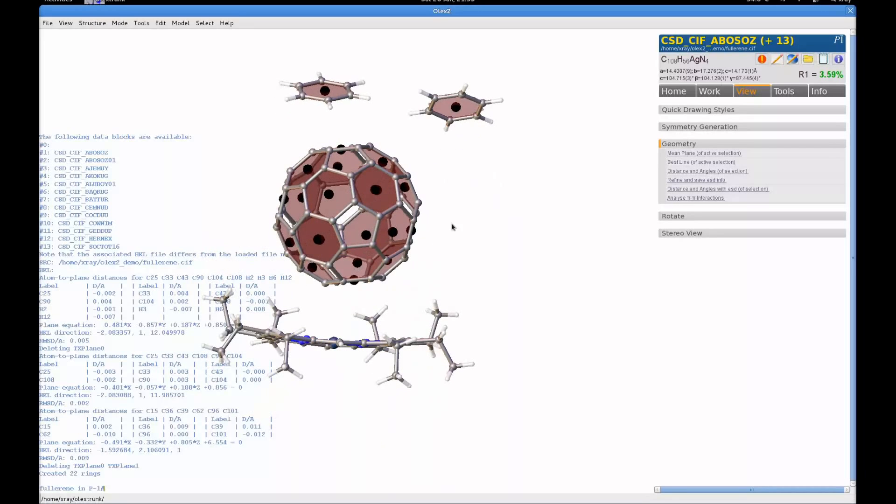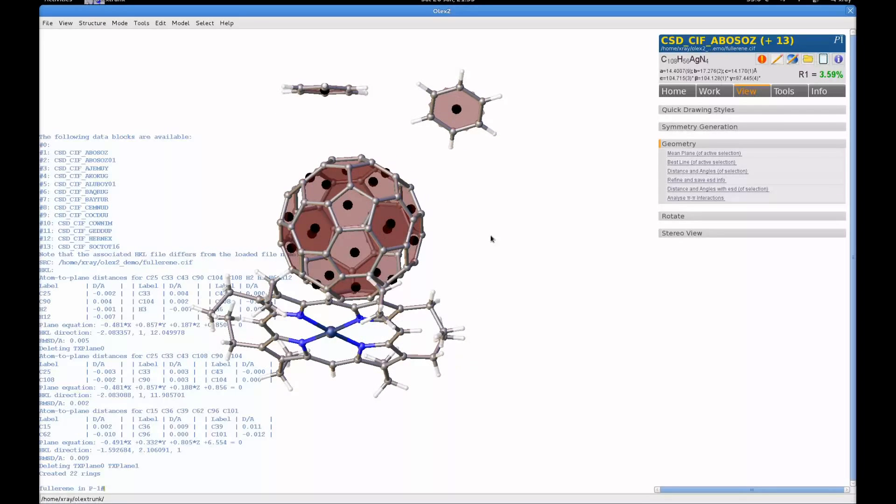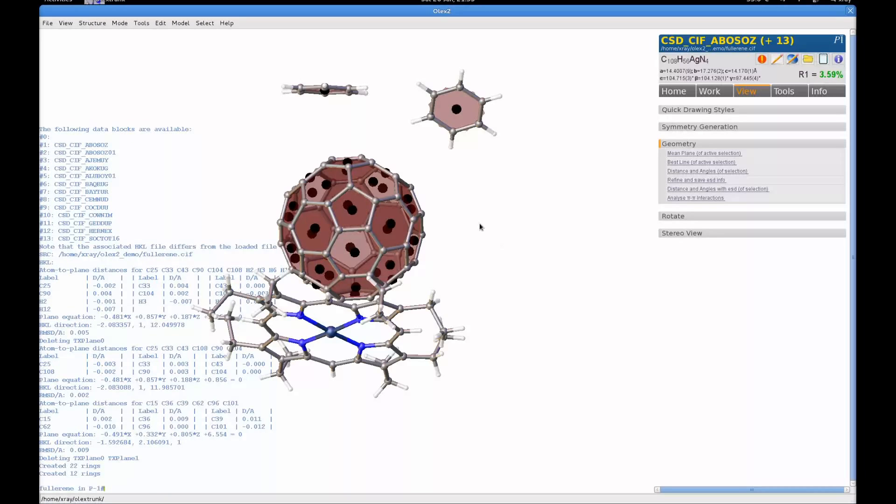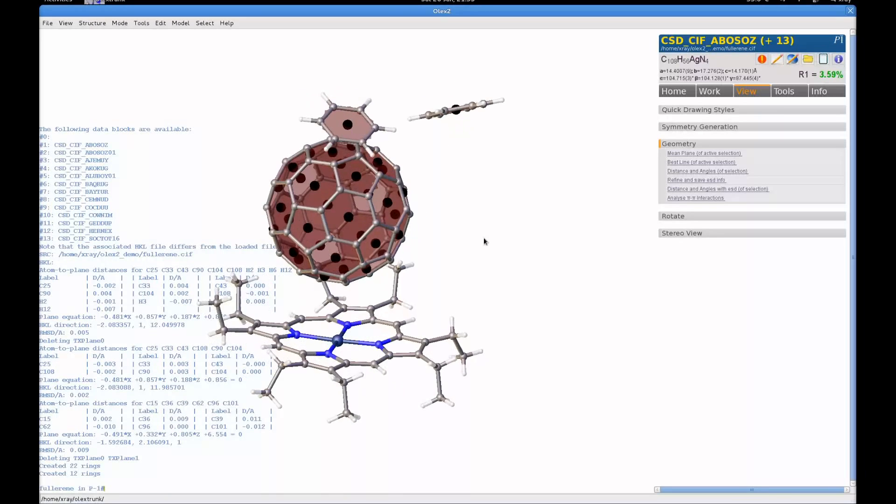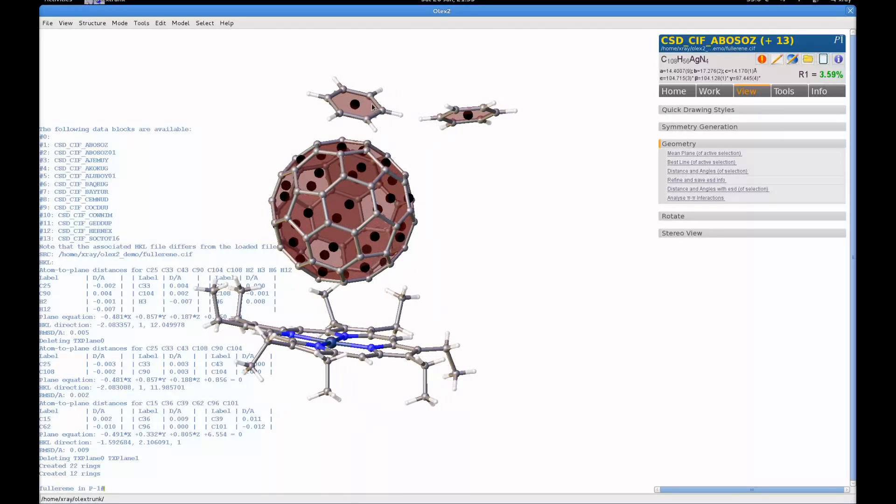This is Buckminster Fullerene. If I wanted to get the five-membered rings, I could do that as well. I would just change from C6 to C5, and now I have all the rings with five carbon atoms, all the rings with six carbon atoms, automatically selected with mean planes.